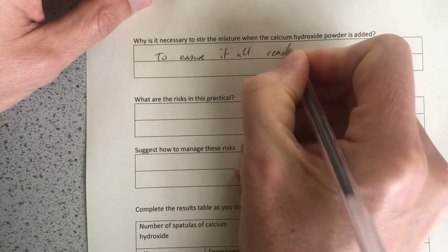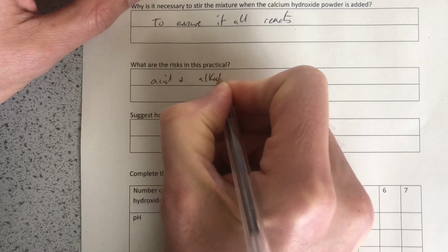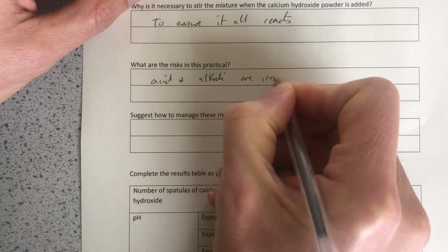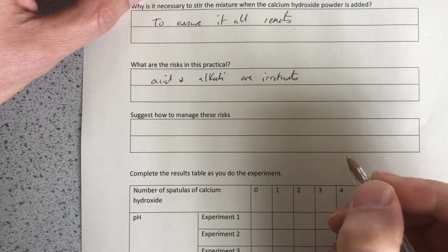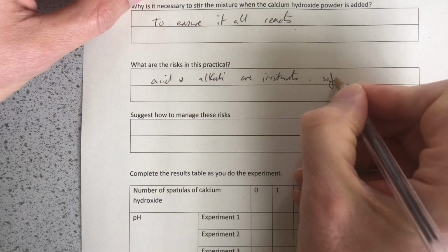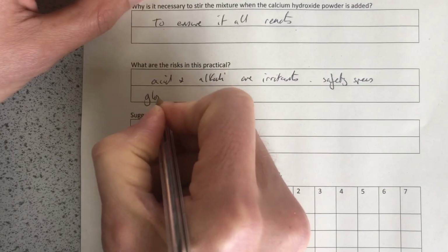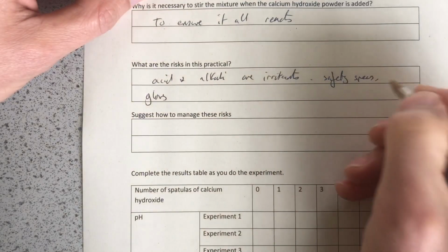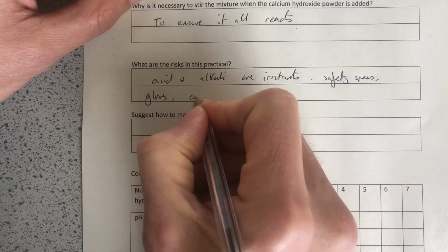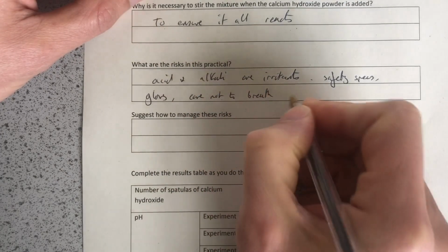So we're going to add the calcium hydroxide and we're going to stir it. What are the risks? Acid and alkali are irritants. That means they're likely to irritate our skin. If we get them in our eyes, they could potentially cause some permanent damage. So we're going to use safety specs. You might want to use gloves as well for the calcium hydroxide because it's a powder and we don't want that on our skin. And obviously care not to breathe in the powder.